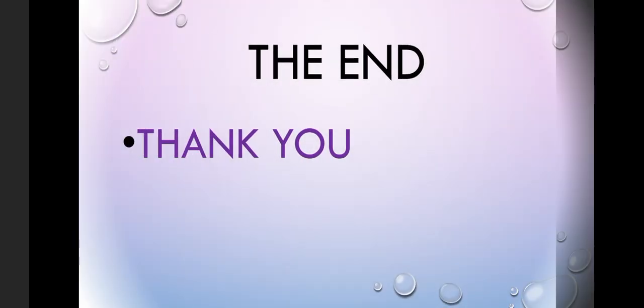Learners, today we have learned that when we are operating in the lab, we have some accidents that can occur. Accident number 1, we have an accident that we are calling cut. There is another accident that we are calling scald. There is another accident that we are calling poisoning. And normally these accidents are caused by dangerous things that are normally located in the lab. Those dangerous things that can cause injury or can harm somebody, we have discussed and we have said that we normally call them the hazards.